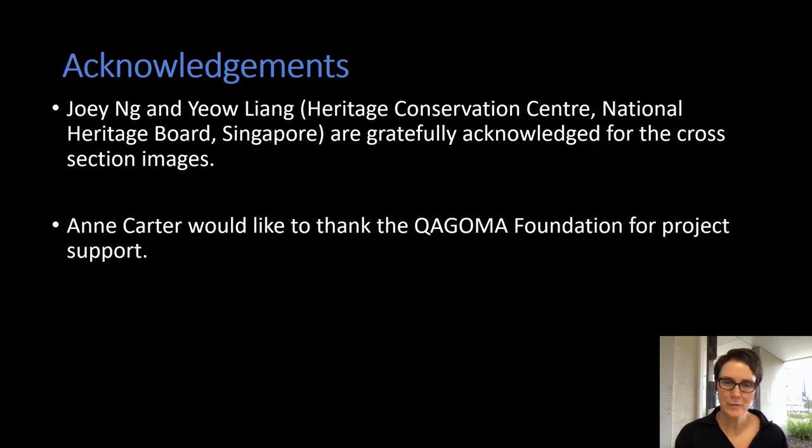I'd like to thank you for your attention. I would also like to note that the analysis of these canvas samples are particular to the samples in this study. Even when we tried to verify our results by purchasing the same canvas from the same supplier, the same brand and the same code, we did sometimes receive canvases which had different analysis results to the first sample analyzed. So please take that in mind.